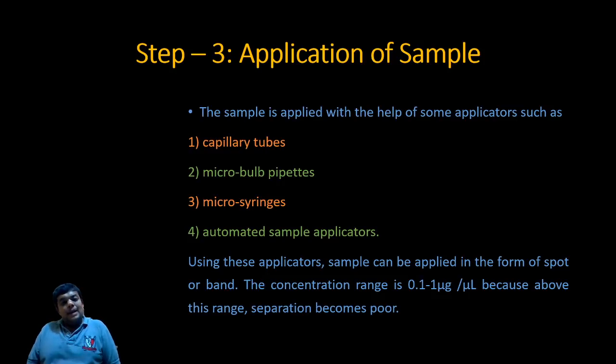As I have told you, and as I have received feedback from you, I have tried to add maximum video in this particular talk to make this machine much clearer to you. In this lecture, I am not focusing on chemistry much, because the chemistry of adsorption remains the same. The chemistry of attraction with the stationary phase remains the same. The one that is attracted more will remain, and the one which is attracted less will go out. But I am focusing today on the instrumentation, which is highly important. So let us see how this application of sample is made possible using an automated sample applicator.